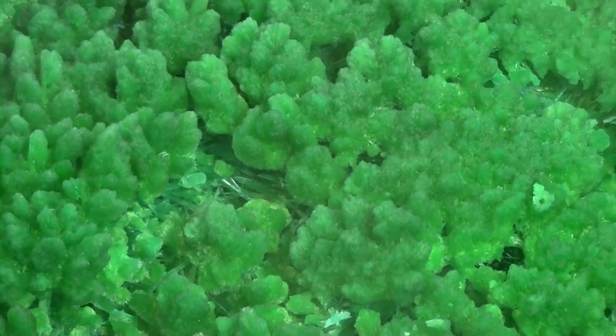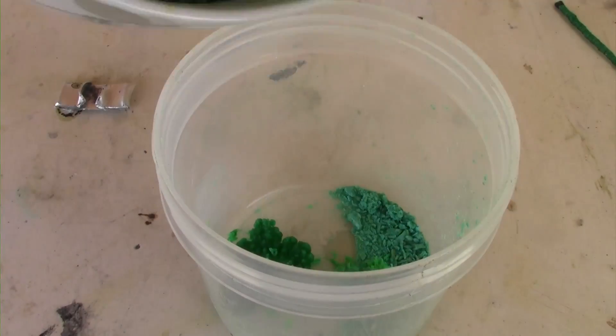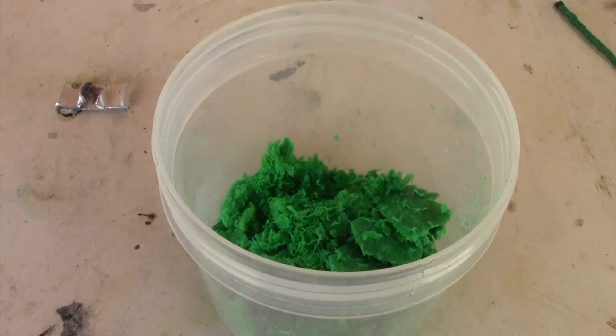This is what I was left with after a few days of drying. I crushed it up and added it to a small container to dry. You can use silica gel in a closed container if you want, or you can just leave it out in the sun for longer.